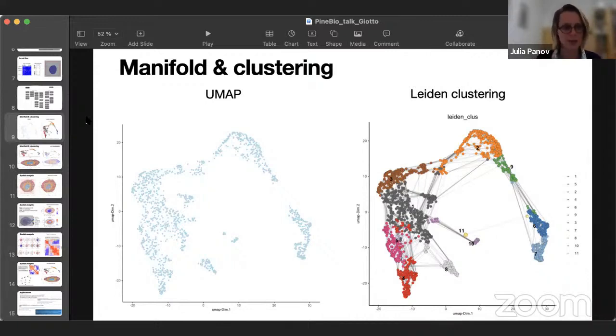So the data is very sparse, and you combine it with your bulk RNA, which is much more stable, but has this average cell that never actually exists. And you do something like deconvolution and use other computational techniques to try to connect those two together. So I think it's the same kind of question.